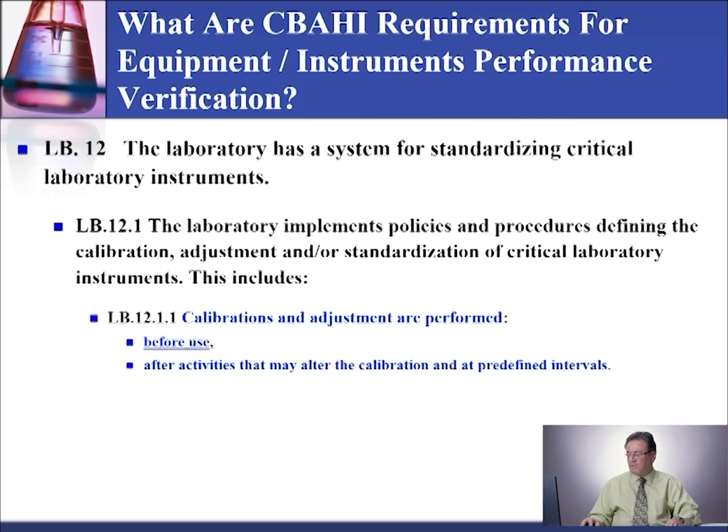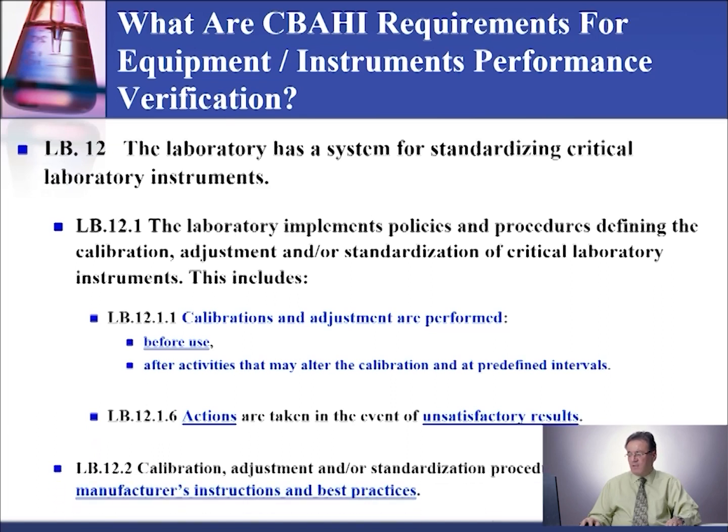As applicable, equipment and instruments should be released for PQ, performance qualification, or routine use after the satisfactory completion of the OQ. This is the form that you could use for the operational qualification.